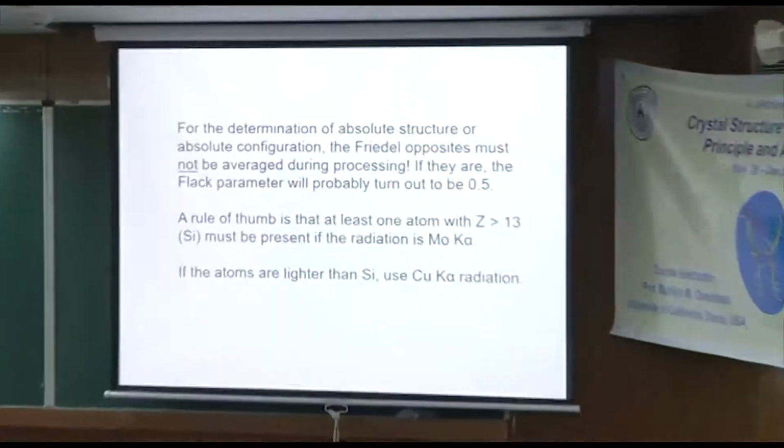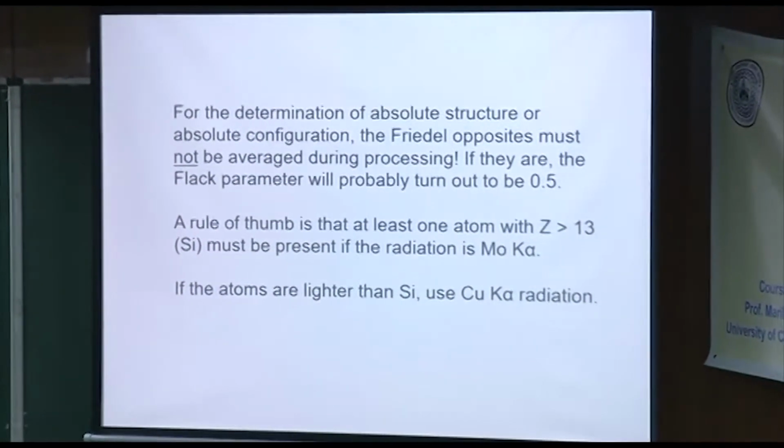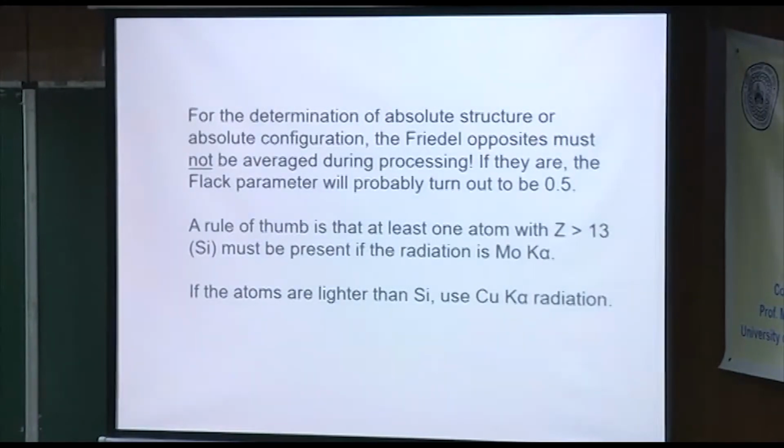And I mentioned this before. You shouldn't actually average the Friedel opposites in data processing if you think it might be chiral, because it might not be correct.